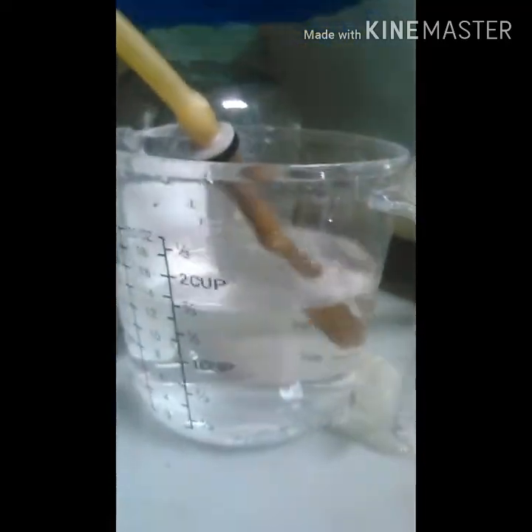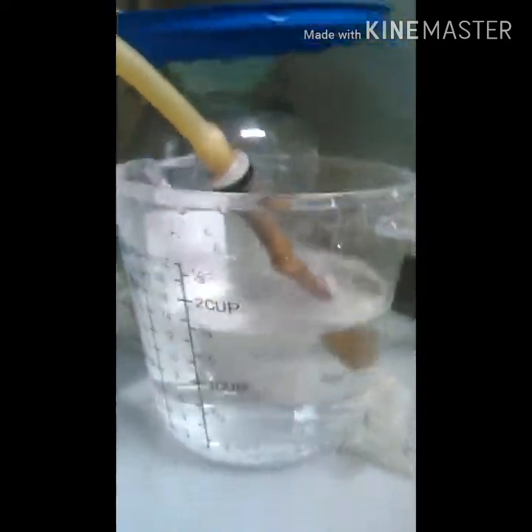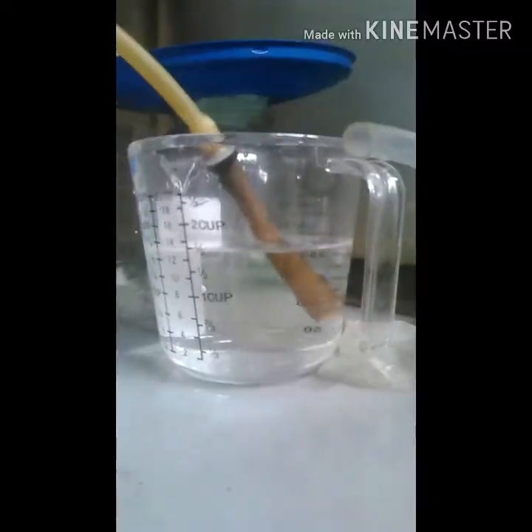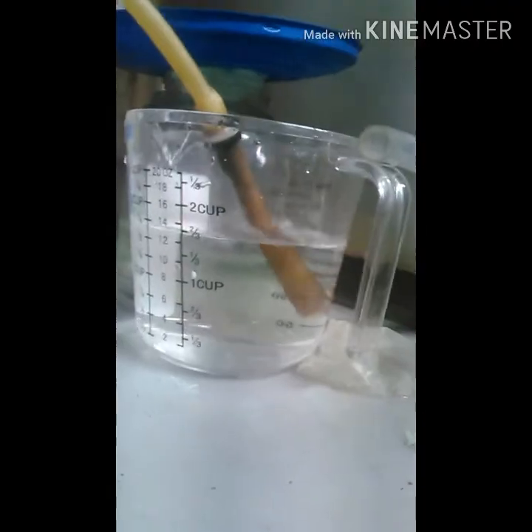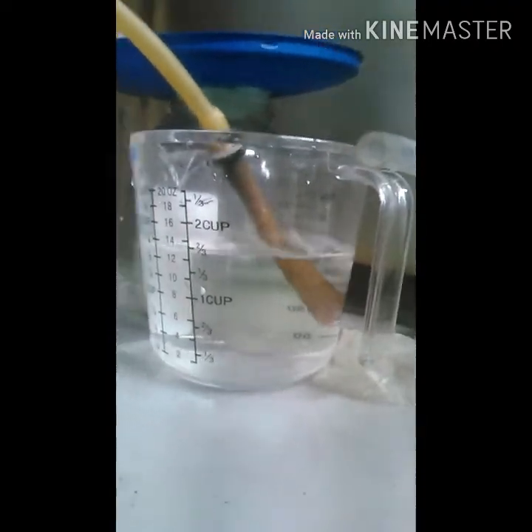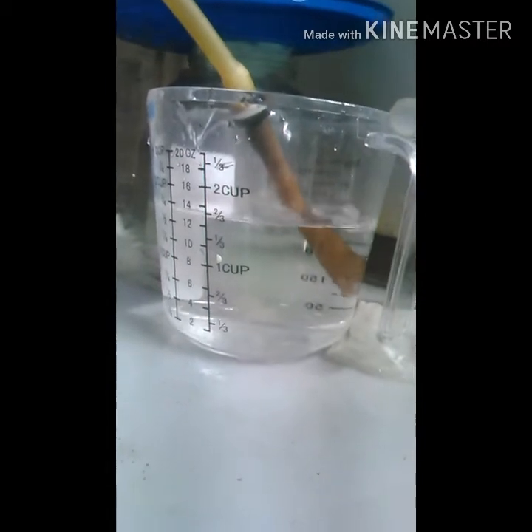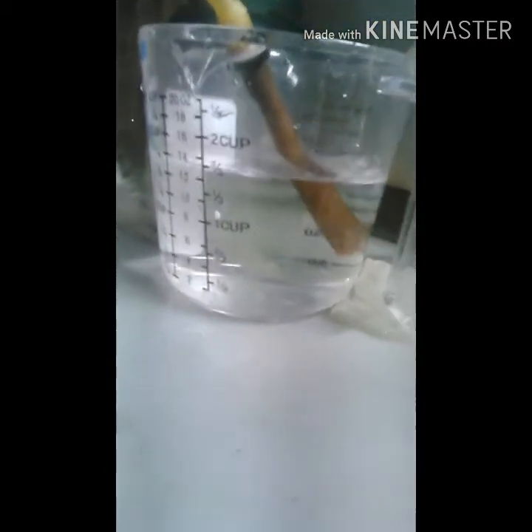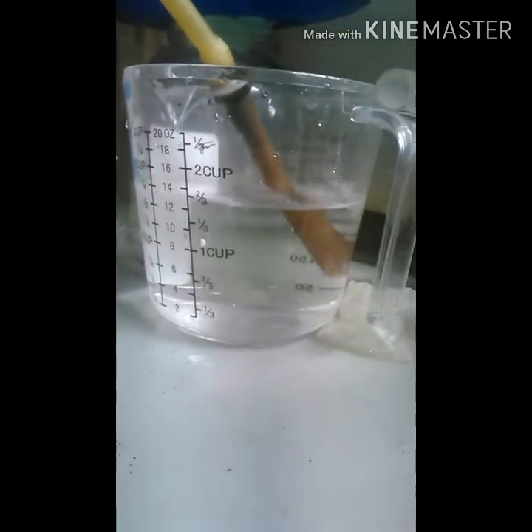Alright, so I went and filled a water bottle and came back — it was literally just a minute — and that's how much it started boiling in a minute. The reaction goes pretty fast as far as getting started. That cup there is going to be where all the acid is formed from the gas coming out.